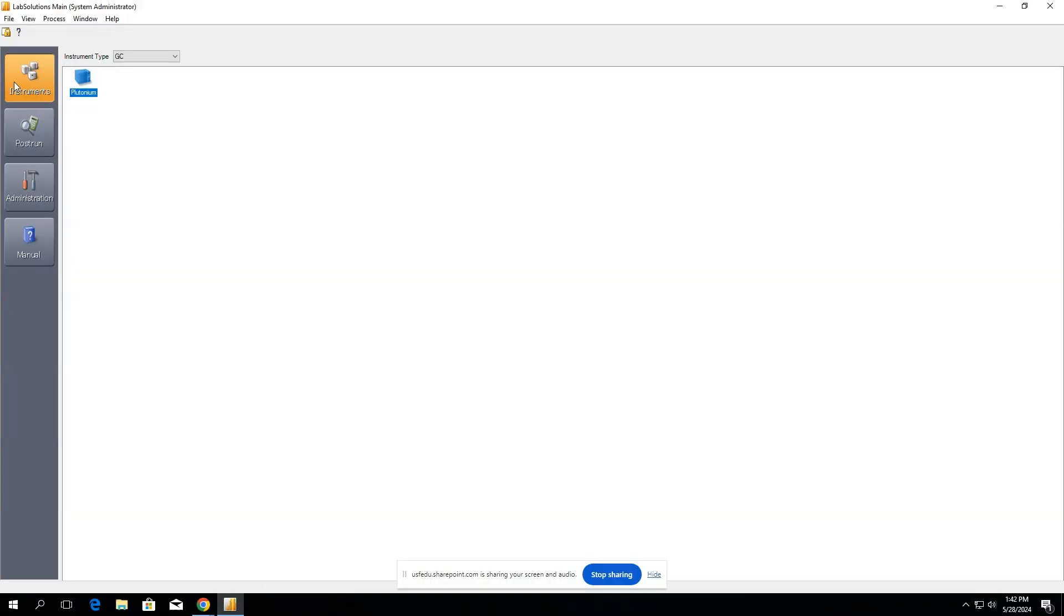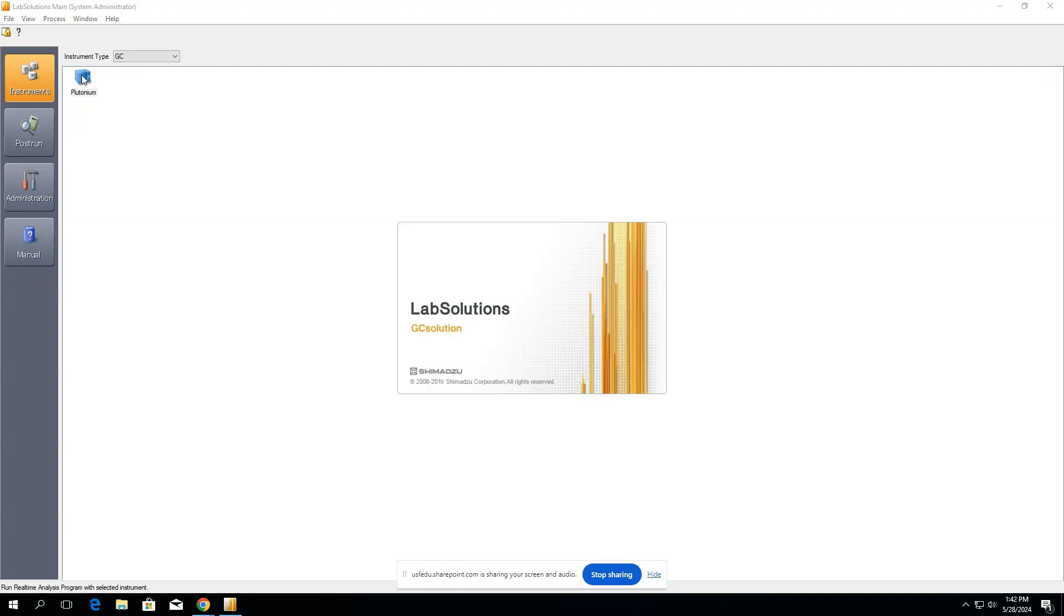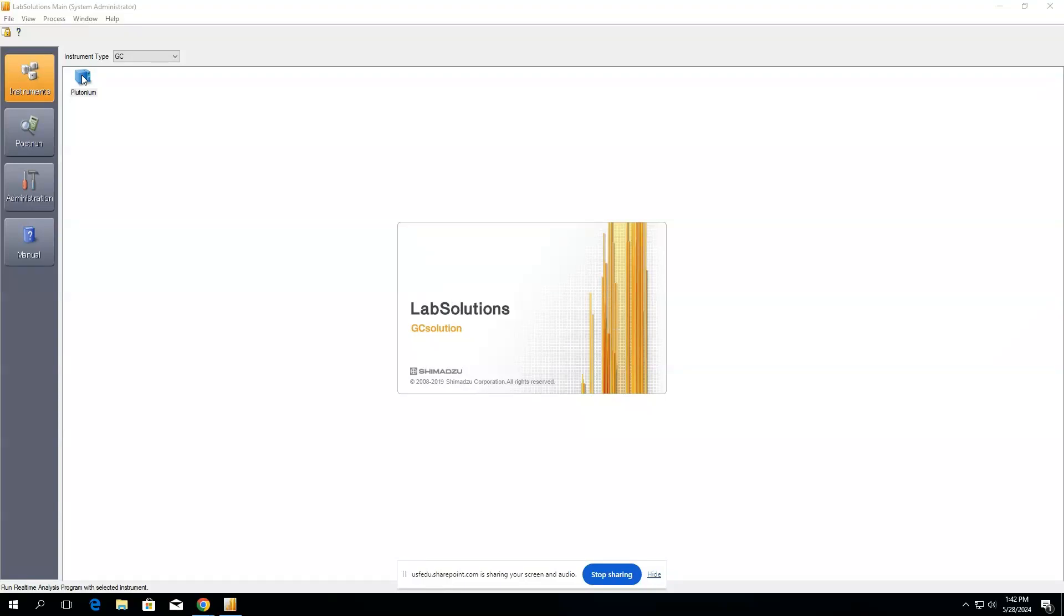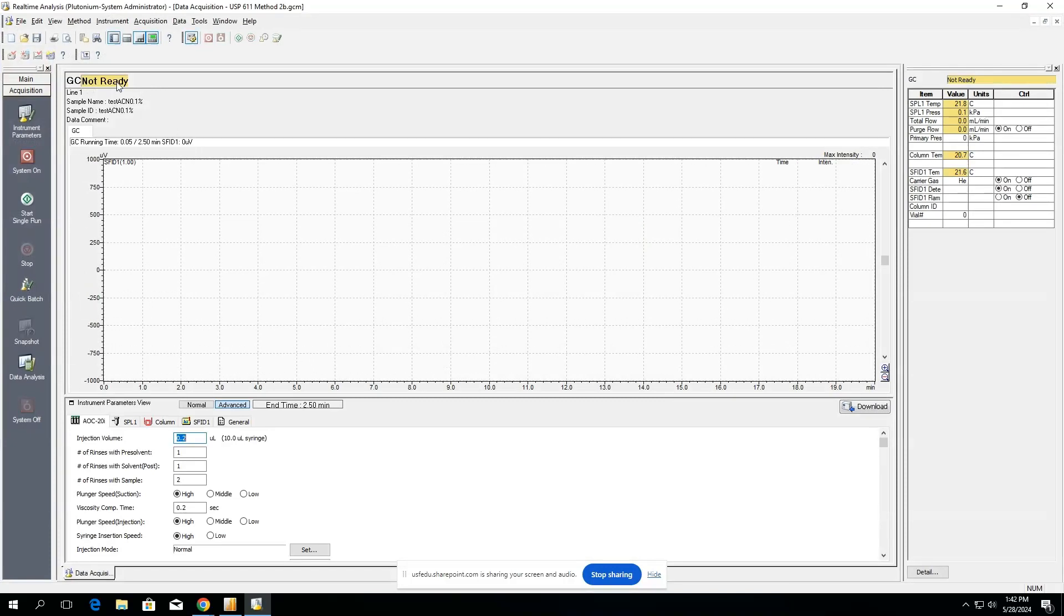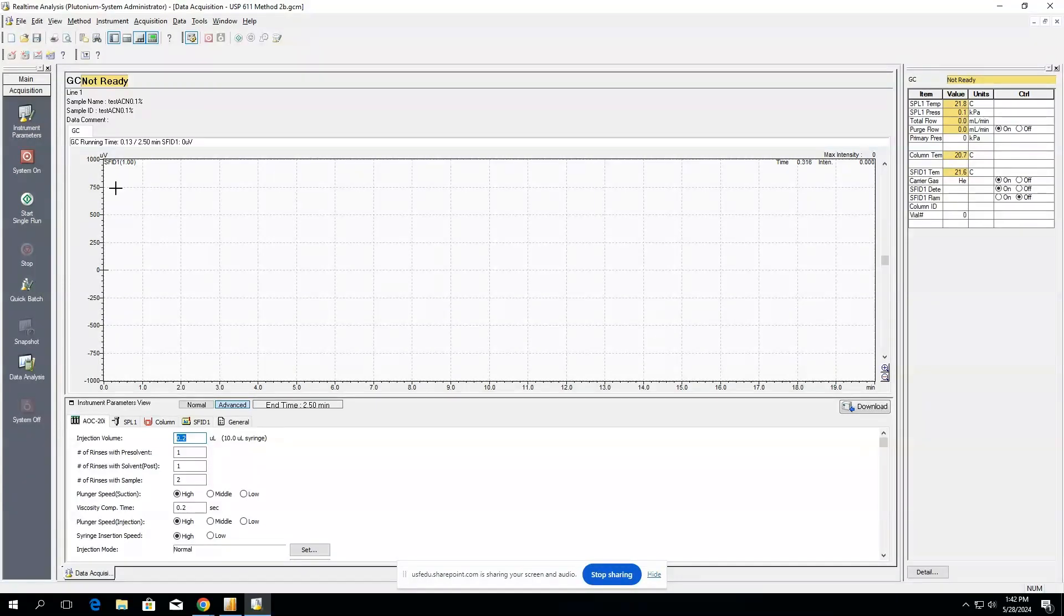When you'd like to make a method, go ahead and open the instrument and then select your instrument. Now that we're connected to the instrument, we can go ahead and make our method for whatever we'd like to run.